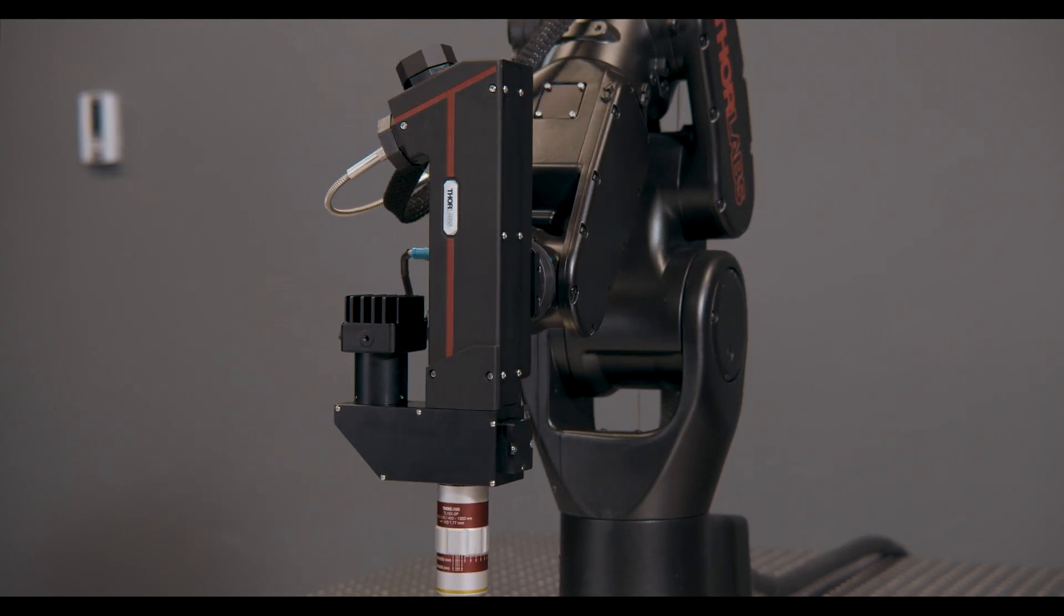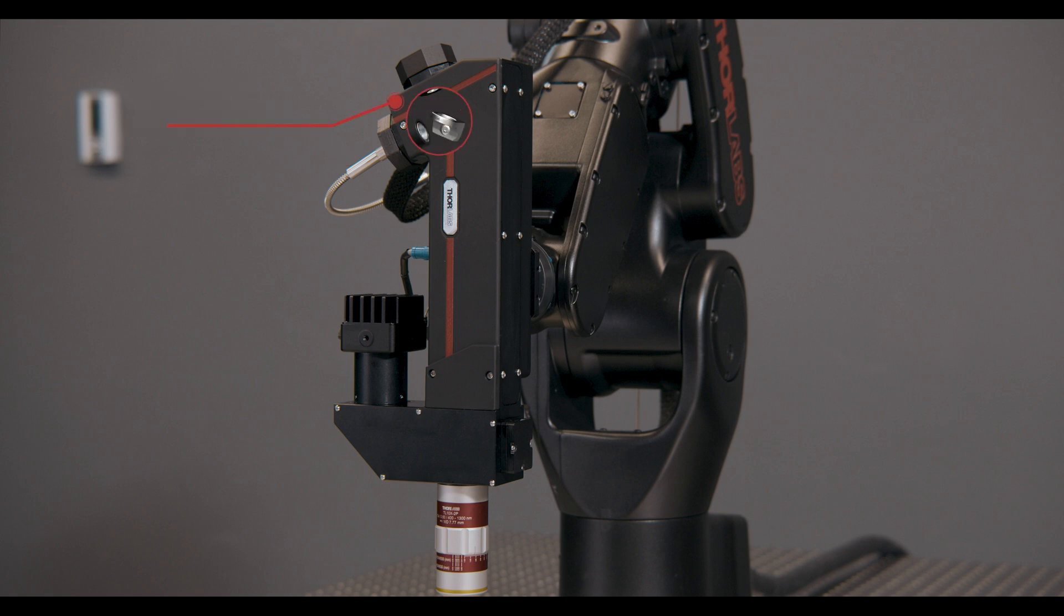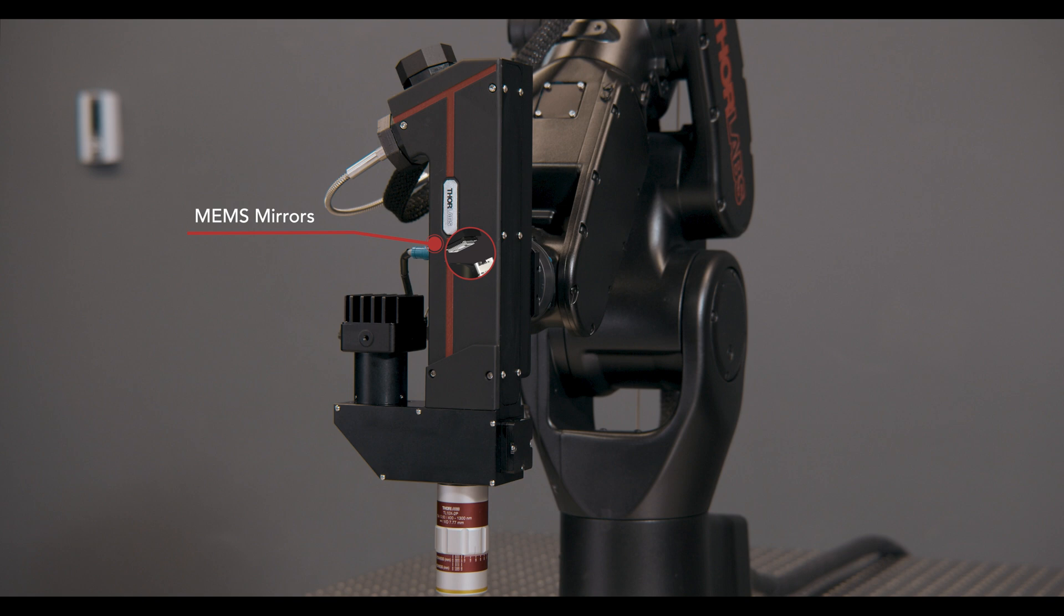We start with a fiber-coupled multi-photon laser. The light then goes through a beam expansion and into two sets of MEMS mirrors, which are divided by two complete sets of scan and tube lenses.